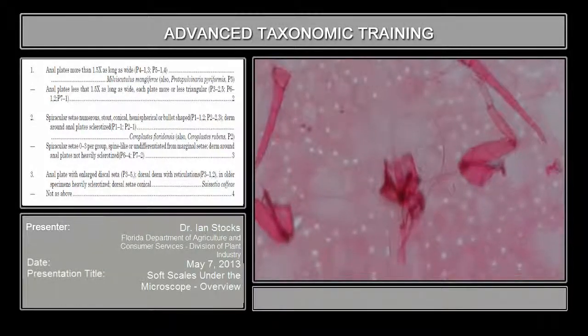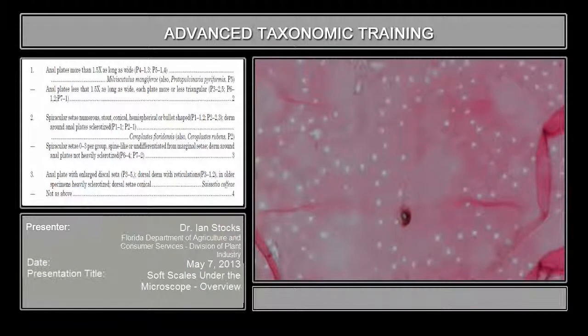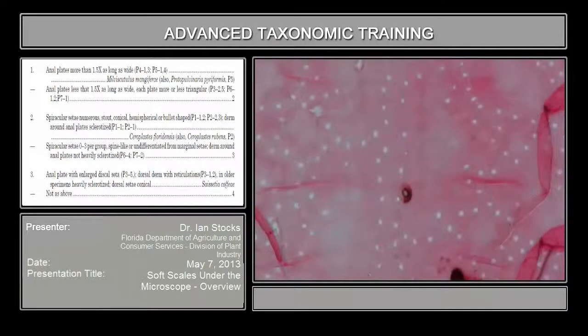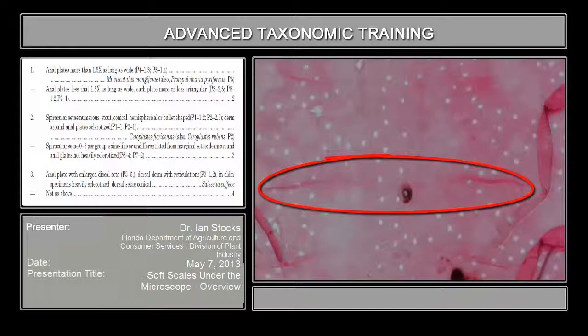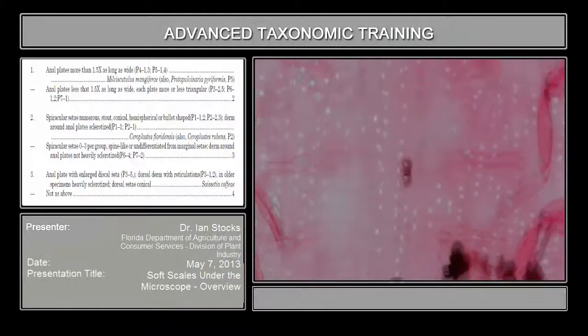Go back to the middle, and we'll just continue moving down the body here. Between the legs here on the venter, of course these are insects, so they're segmented, and you can still see parts of the segmentation pattern here. For instance, these pink lines are sort of enhanced sclerotization that mark the boundary between two segments. Okay, we'll continue down.